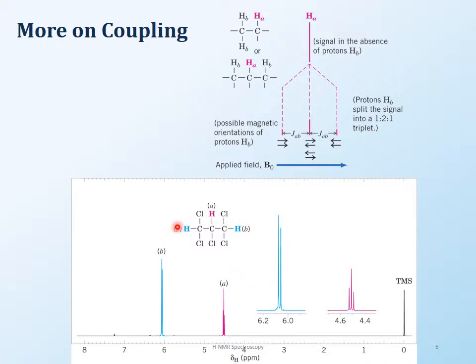These 2 hydrogens, which are the same, they're equivalent, they're looking at this hydrogen, so they should give you this hydrogen plus 1, which is a doublet. Now the pink hydrogen here is going to be upfield shifted, whereas the blue hydrogens are going to be more downfield shifted because they're attached to a carbon with 2 chlorines. The pink hydrogen is attached to only a carbon with 1 chlorine, so it's a little bit more upfield shifted. Okay, so that's about the chemical shift.